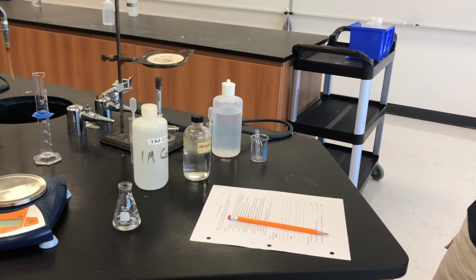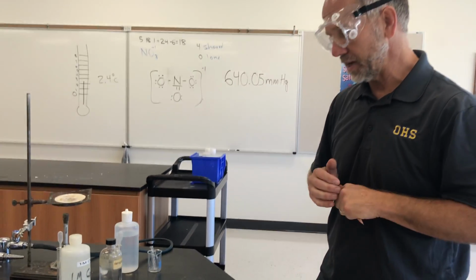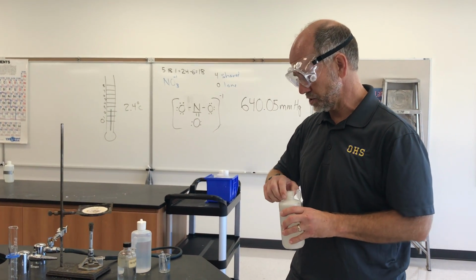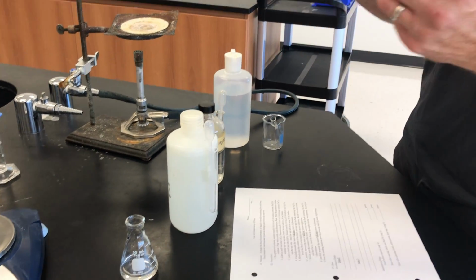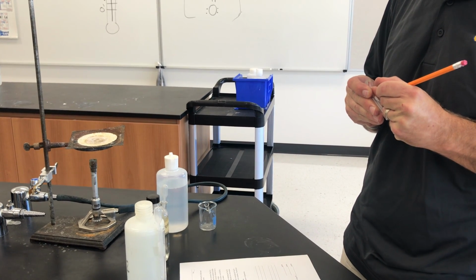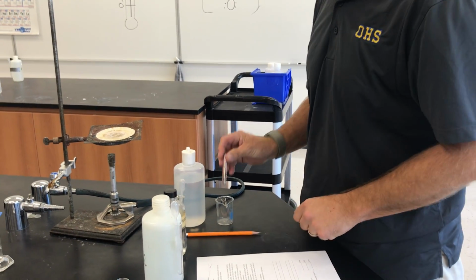The next two steps then are getting small samples of two other solutions. The next one is a calcium chloride solution, but because we only need 3 milliliters of this, we have to dispense this 1 milliliter at a time. In order to do that, we'll dispense this into a small test tube, which we first of all, as it says in the instructions, will label as calcium chloride.